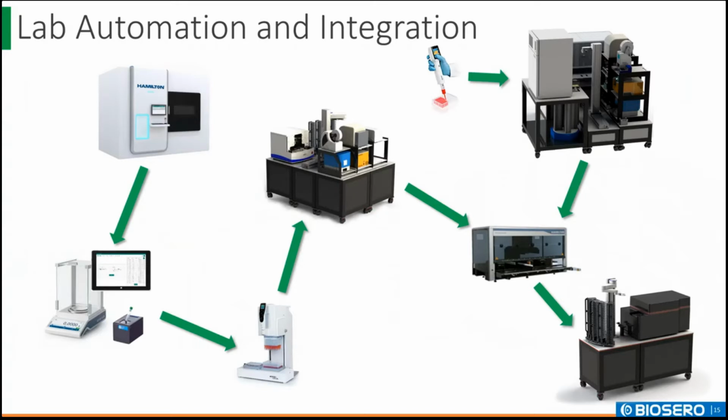So here we have an oversimplified pictorial representation of a drug discovery workflow, and as you can see, it contains a lot of different types of steps in the process, from manual, compound weighing, to semi-automated to fully automated steps. Now, there's a tremendous amount of value in the data generated from a process like this, but it's often siloed, whether it's in log files on an automation system or on an instrument, or notations in a notebook, or simply not captured at all. The samples are often moved to these processes by people in an unscheduled manner, and with very little thought to integrating this at a higher level.